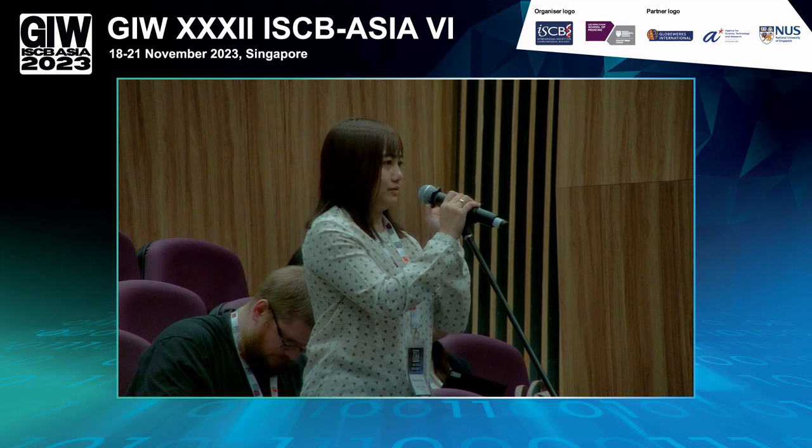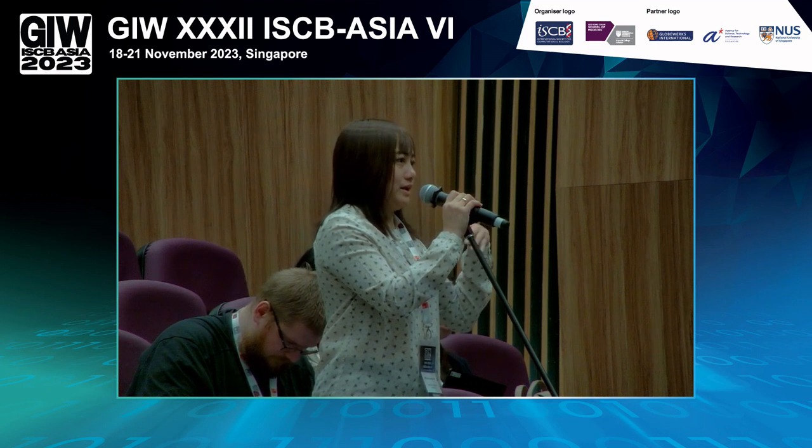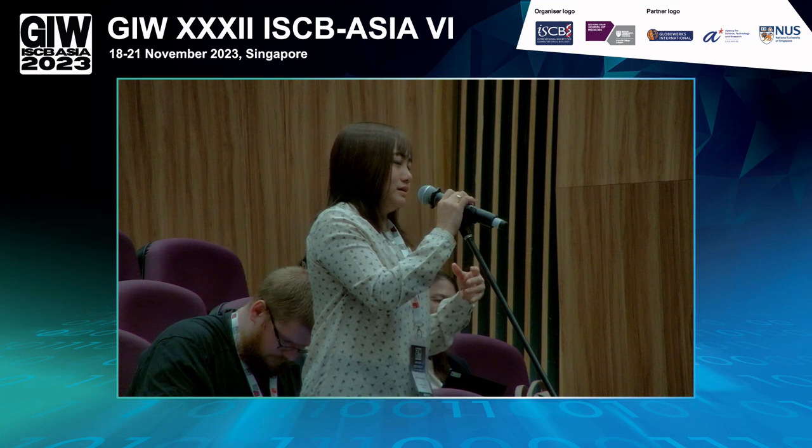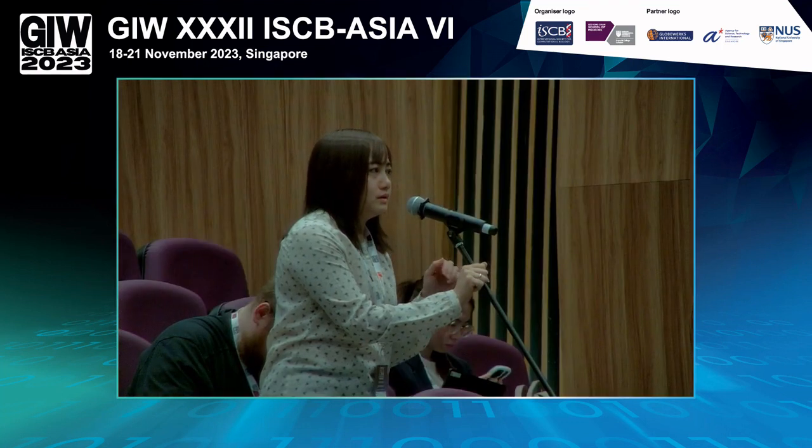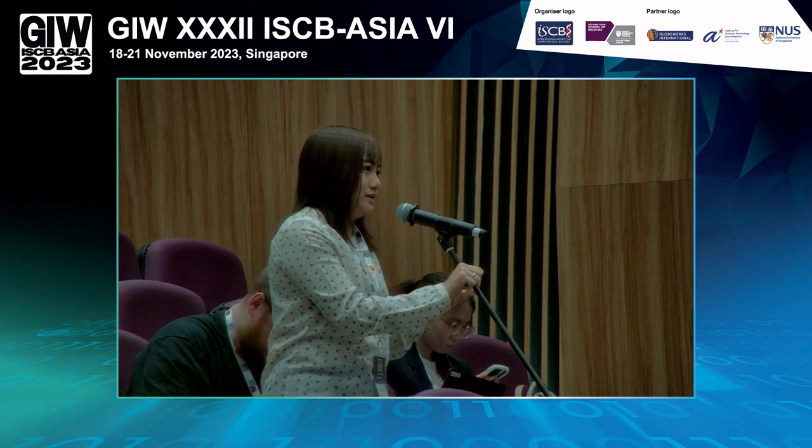But it still has a quite significantly higher error rate than the short reads, right? I think we have to compare the chemistry. So maybe we can chat offline about what you're using and how to go about it, because I think there are a lot of other tricks to improve the quality of the variant calling as well. Do you know the percentage of how much we can polish it until we get it to the most reliable we can get?